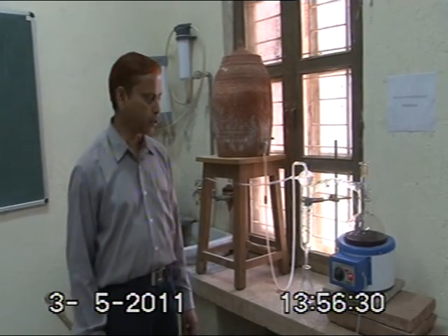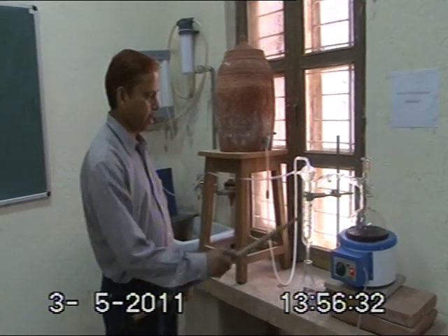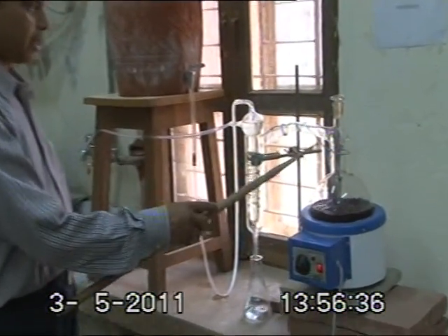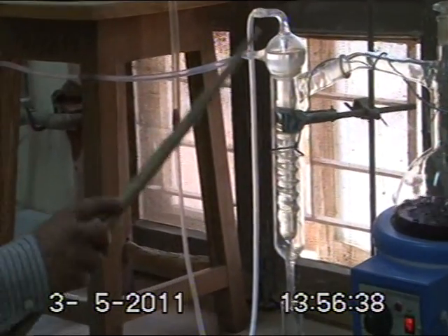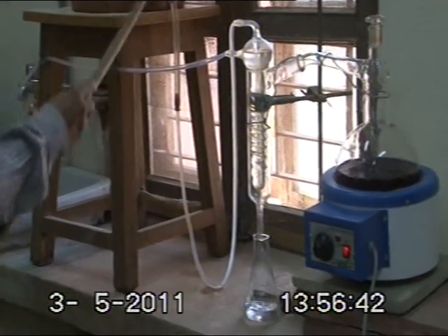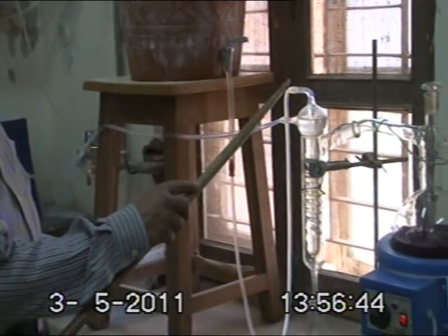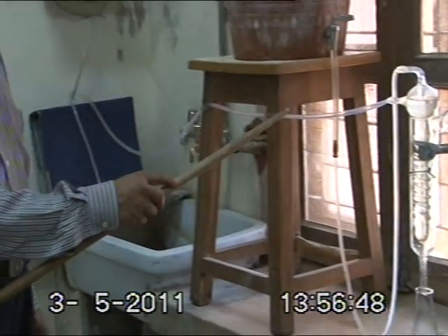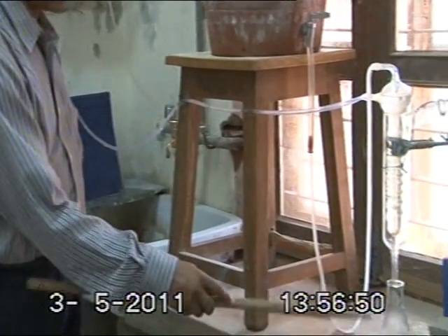In most laboratories and industries in the world, during the process of making distilled water, the water that is boiling here produces vapors. These vapors are condensed in this condenser tube. The cooling water enters through this inlet tube and leaves the condenser tube through this outlet tube. This is the way distilled water is made.